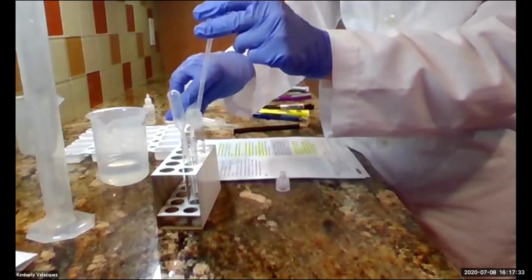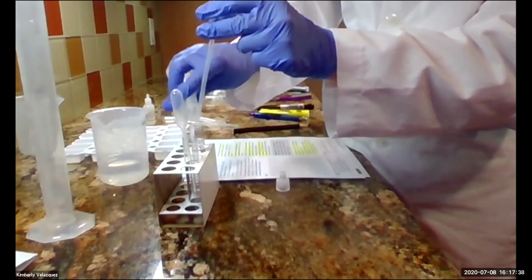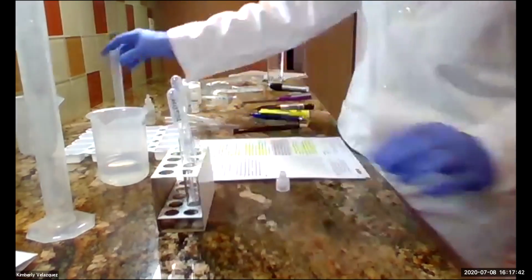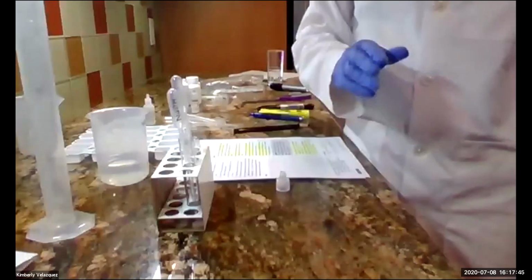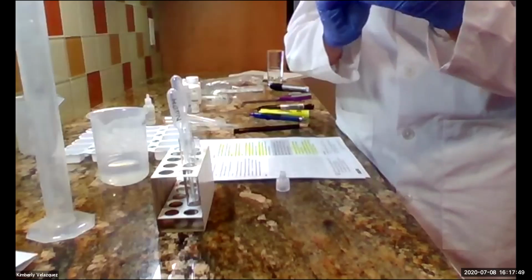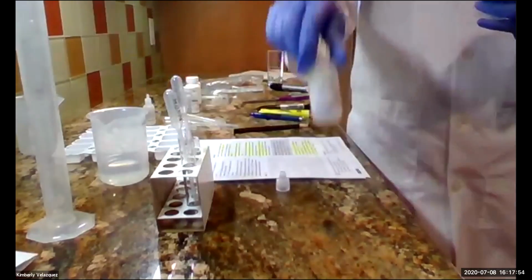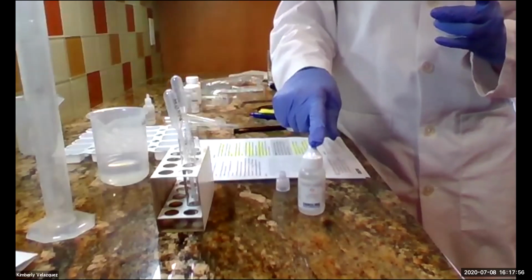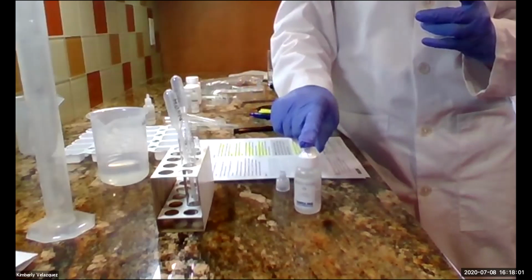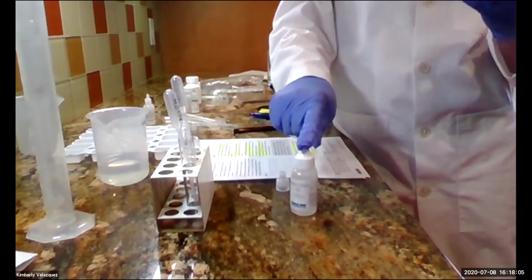And I'm going to add it to my test tube labeled hydrochloric acid. Okay, I'm going to do the same thing for sodium hydroxide. I'm going to go rinse this out in the sink first. Okay, we don't want to contaminate this. Next solution. Okay, then I'm going to add 1.2 mils of pure sodium hydroxide. You have more sodium hydroxide than hydrochloric acid because this gets used for activity 2 and the hydrochloric acid does not. So you use this for 2 activities, that's why you have more of it.